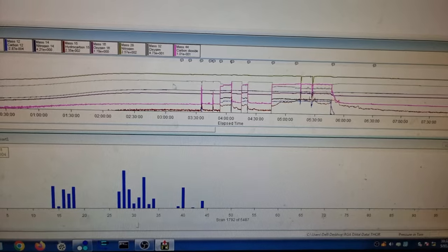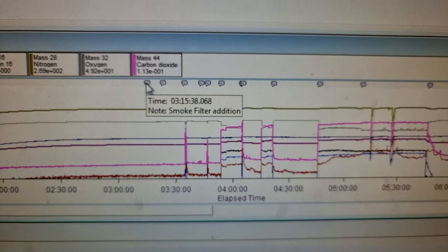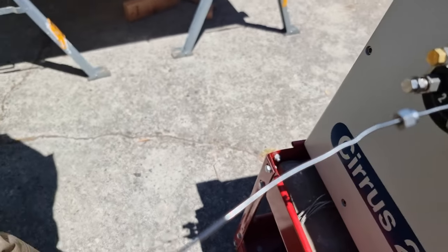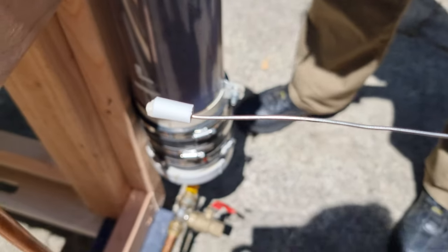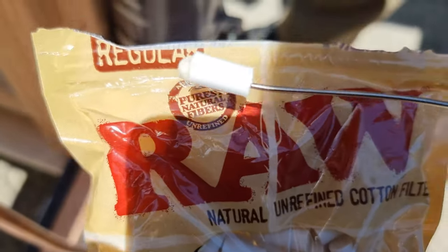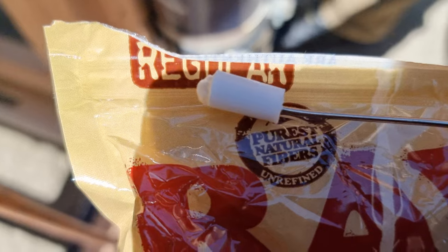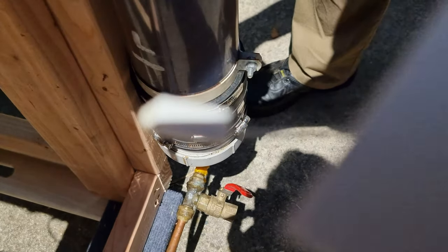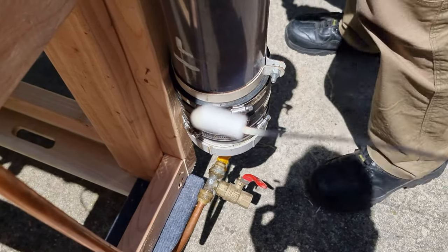As we go through, these spikes are when — this one here is where we first attempted to add a smoke filter. So we have the Cirrus II here with sampling port 4, and for several hours we've been taking a background of the air. At the end of that, we replaced some raw natural unrefined cotton filters, and around that we're going to put this alumina felt. The alumina felt is effectively the high-temperature component.